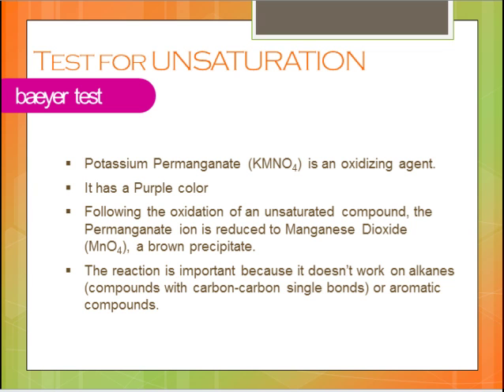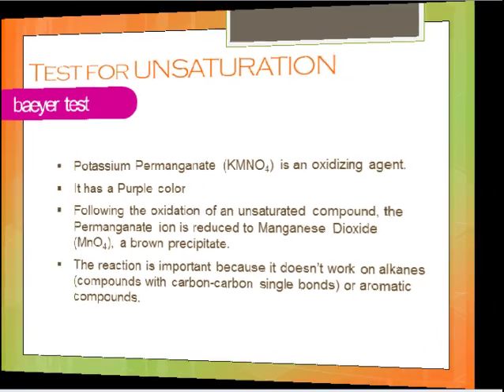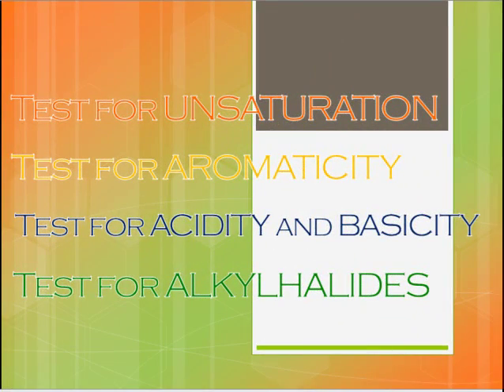This reaction's significance is due to its ability to react only with alkenes and alkynes, and not alkanes or aromatic compounds. So there, we finished the test for unsaturation. We now proceed to the test for aromaticity.